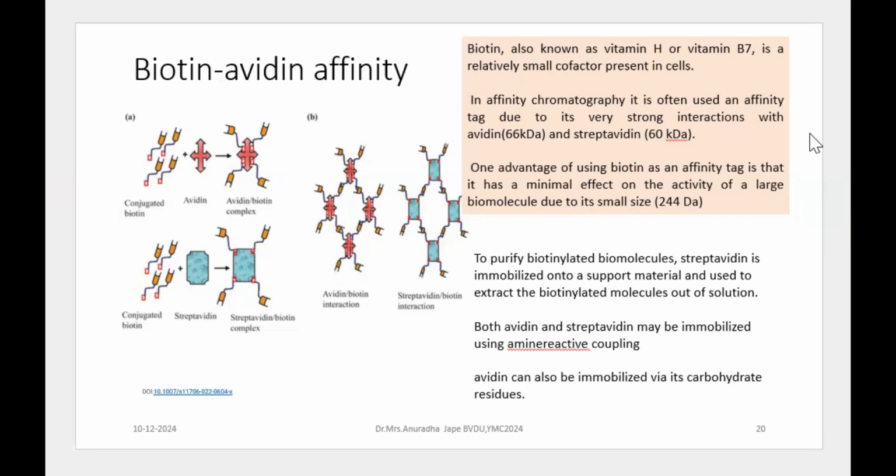So we have taken some examples wherein biological specificity is known and is explored in affinity chromatography. For example, we have talked about antibodies, which are selectively used in advanced techniques like ELISA. Also, you have different types of ELISA where you are using the specificity of antibodies with the antigen, in the detection or quantification of antigen. Similarly, you can use antigen antibody interaction in affinity chromatography.